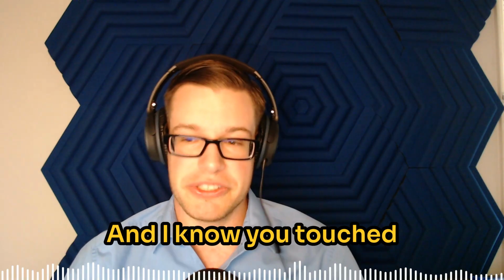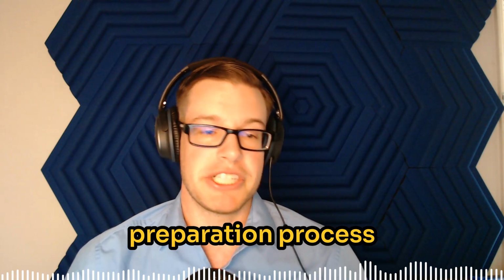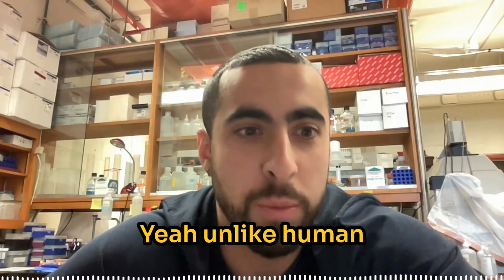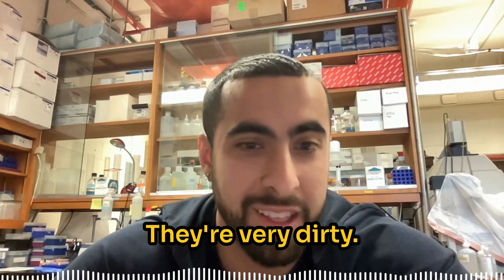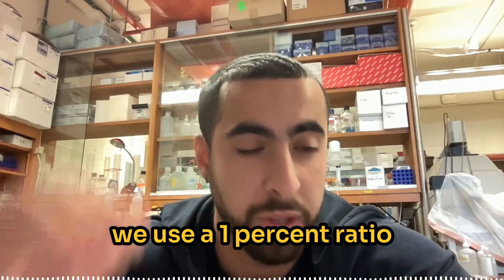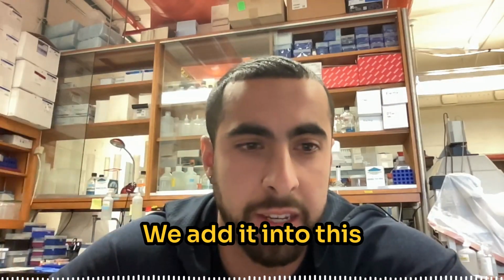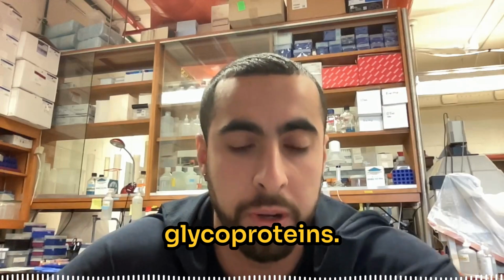Very good. And I know you touched on it briefly, but could you get into the sample preparation process that you're using? Yes, unlike human fecal samples, which we also do, we have to ship those off. They're very dirty. They have a bunch of stuff in them. So instead, by using an in vitro batch approach, we use a 1% ratio of our fecal sample. We add it into this complex medium, add our nutrient that we want to add. In our case, we add glycoproteins.